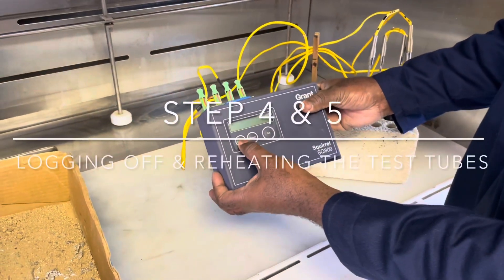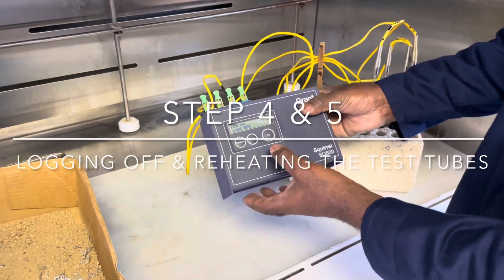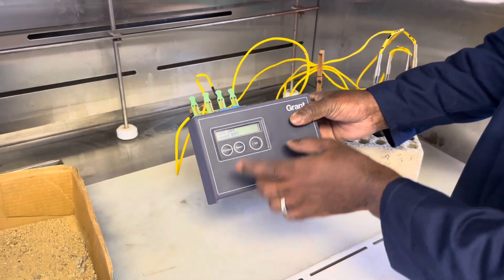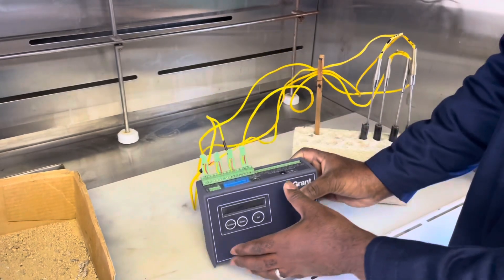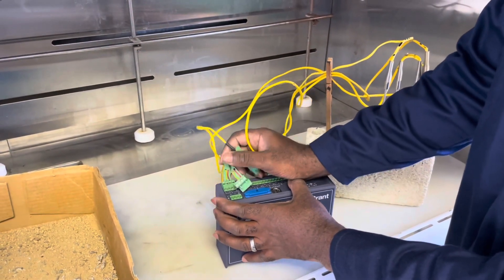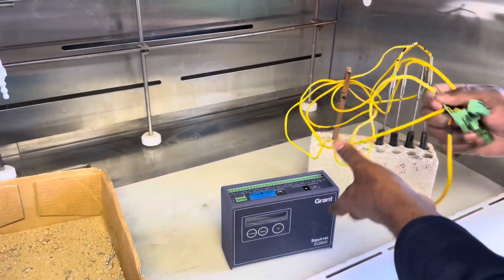After 10 minutes, set your data logger to logging off by first checking that it still says logging on, and then pressing the set button until it says logging off. You may then remove the thermocouples from the different channels of the data logger.